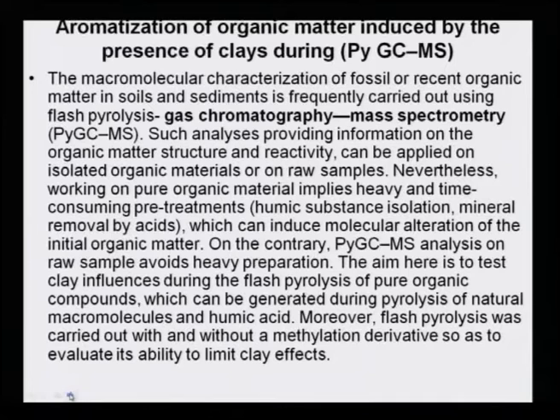Aromatization of organic matter induced by the presence of clays during pyrolysis GCMS. Now, I am giving you the varieties of GCMS and its adaptation for different samples, so that you are aware of the fact that so many variations can be carried out by this particular method, which is broadly called gas chromatography mass detector.